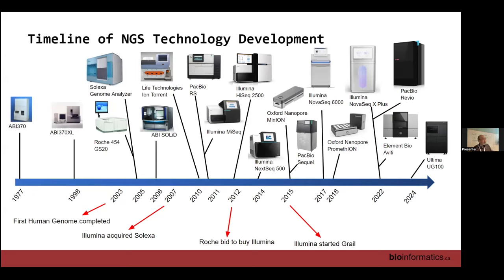Every few years they change their chemistry, and they change a little bit how the instrument looks. But comparing the first generation iPhone to now, like the iPhone 16, we're getting better and better at a lot of things. You want to take a better picture? Definitely. It's the same for the human genome. You can get a lot more now from the new generation of sequencing.